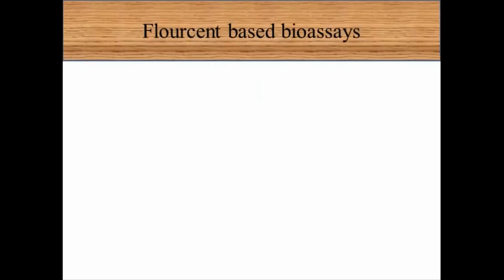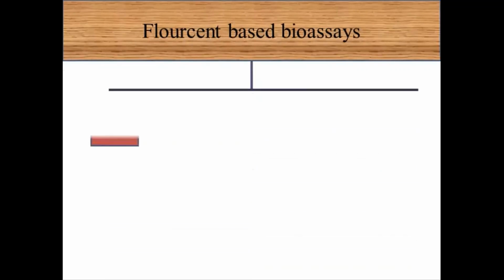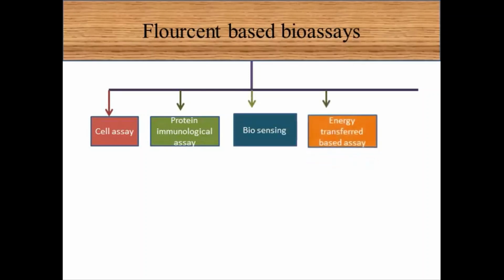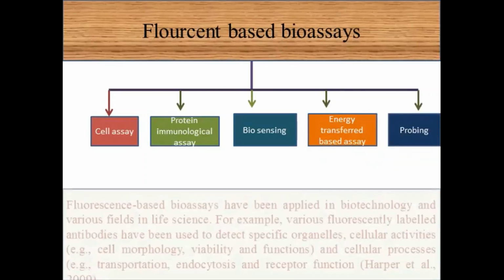Here are some fluorescent-based bioassays. The first one is the cell assay, then protein immunological assays, biosensing, energy transfer based assays, and probing.